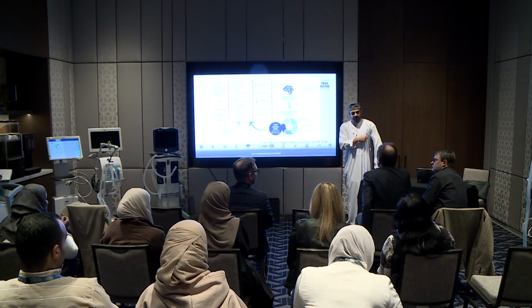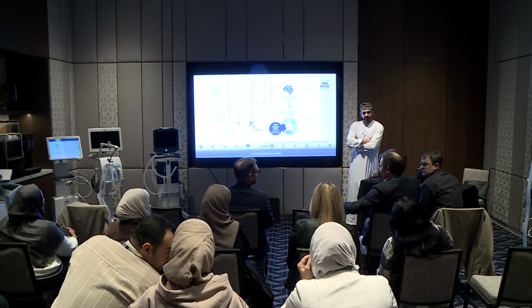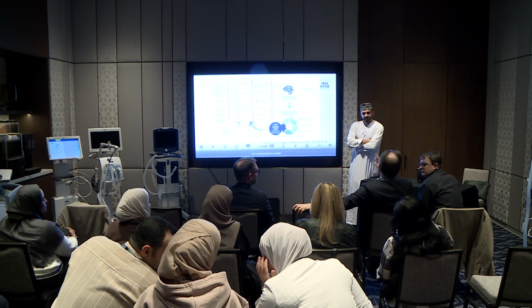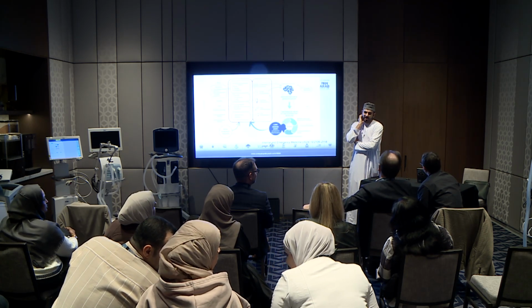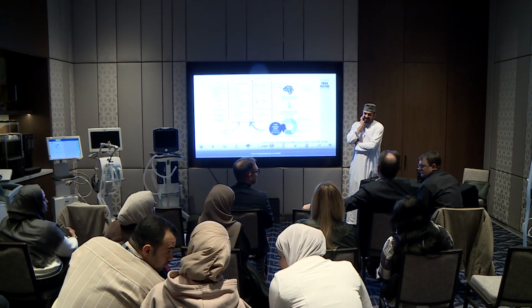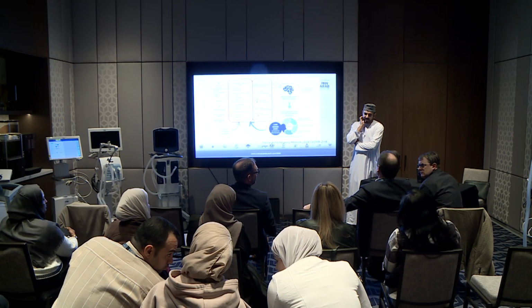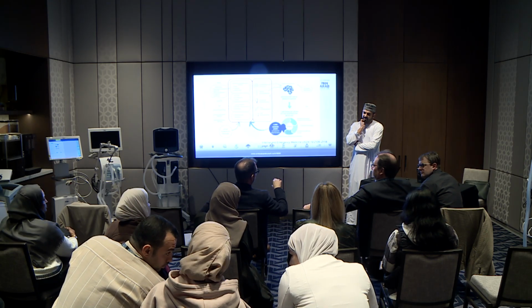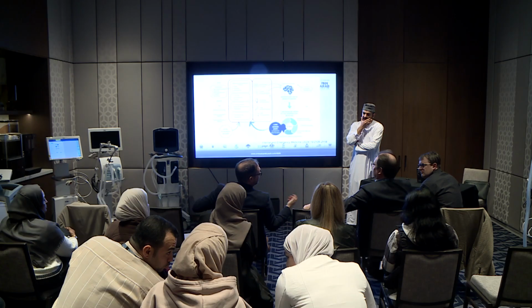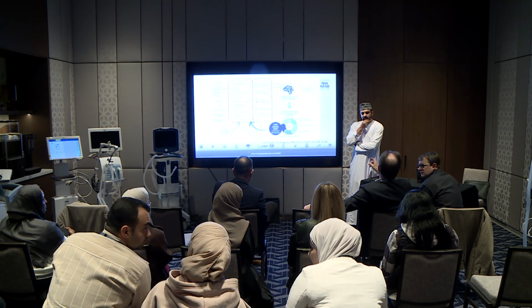When you do the POC, because this is a method that we always discuss, which of the drops do you measure? The first one, the second, the third, because each one can be different. I think the average between the three of them. Not the first one, because depending on how... Do you mean three in the same hole? Or the same hole. So I think the first. Yeah, so we use the first one, but it can be very different.